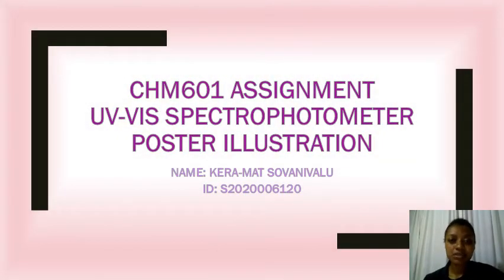Hello everyone. Today I'll be illustrating the poster that I've created using Microsoft Publisher. The instrument that I'll be illustrating on the poster is the ultraviolet visible spectrophotometer.